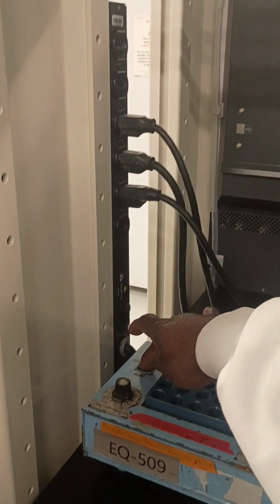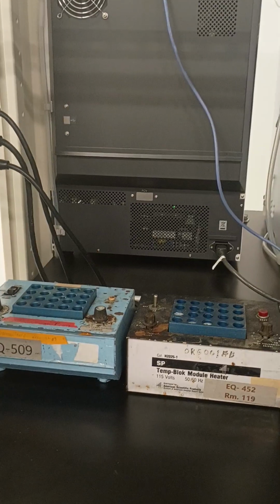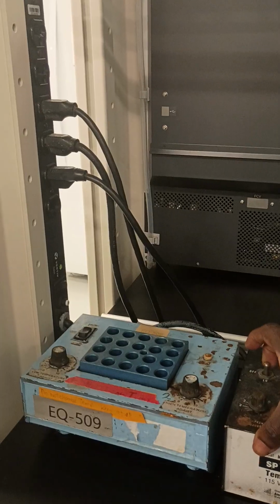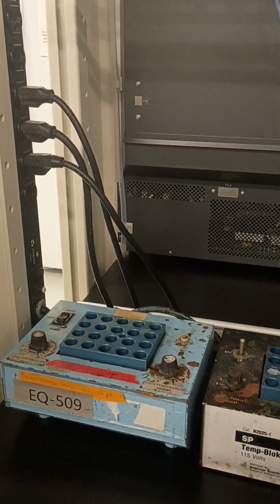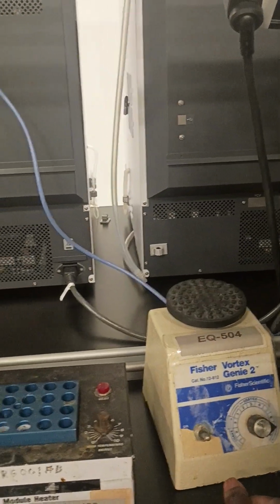Same thing. On high, off, on low, off. And that one, you had it on there too, I think. This one is just the shaker. Stop.